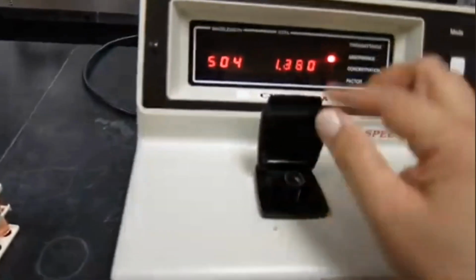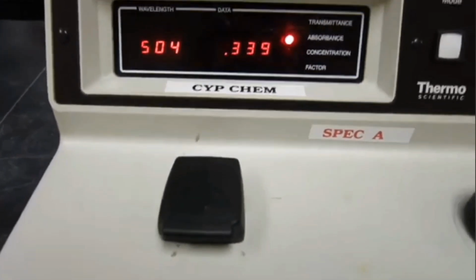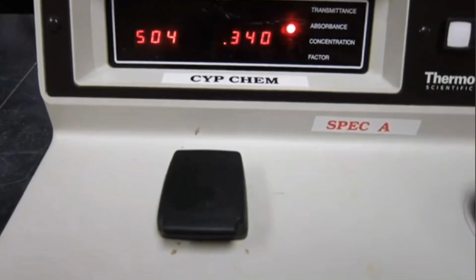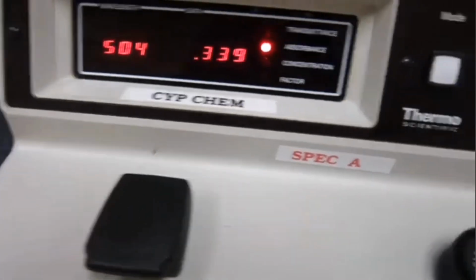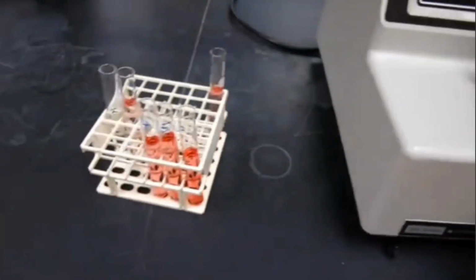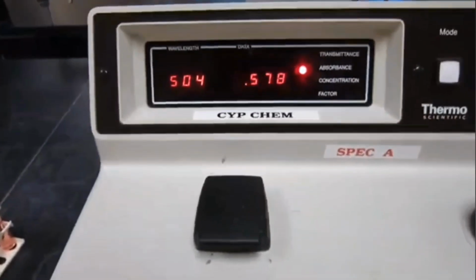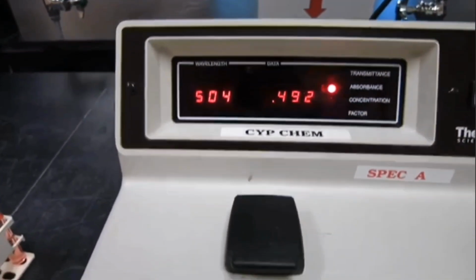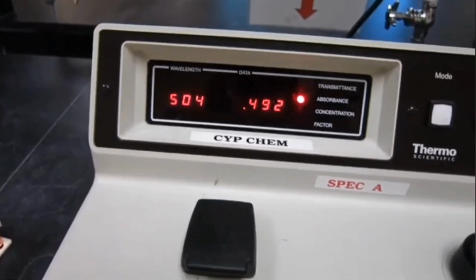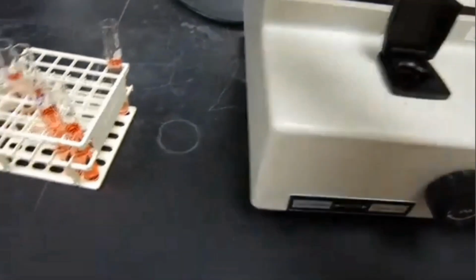And then you take the second cuvette, put it inside the spectrophotometer and read the absorbance. So you can see that the absorbance increases as the concentration increases, and you're going to write it down. It's very easy to operate the spectrophotometer. You just have to put the cuvette inside and make sure to wipe outside the cuvette to get rid of any dust and dirt with a Chem wipe, which I will explain during the class, actually when we are doing it.